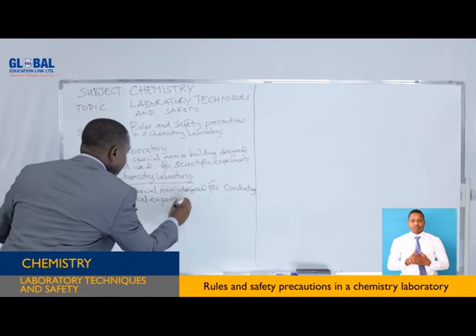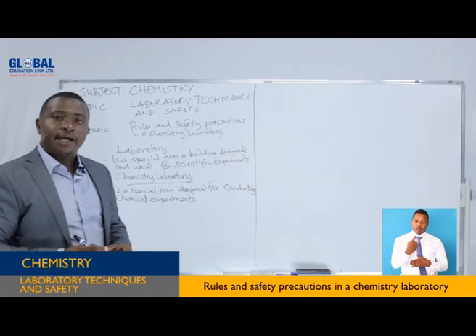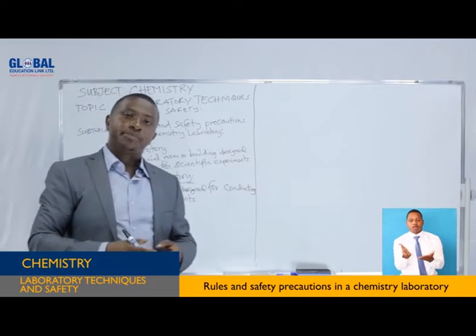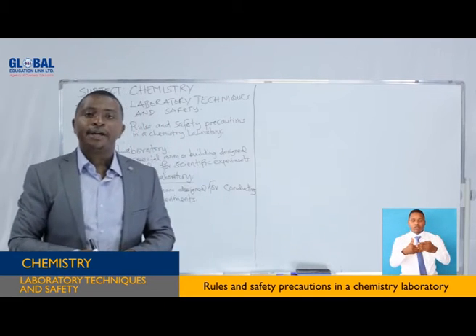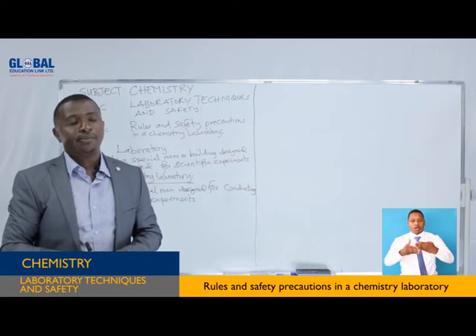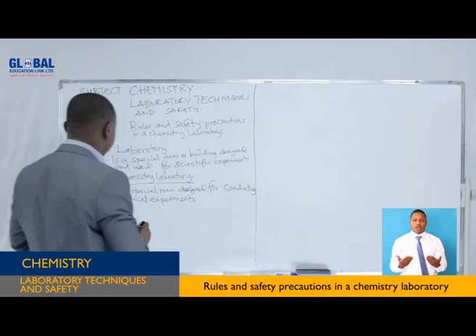I said that a chemistry laboratory is a special room, a special place, a special building whereby chemical experiments are conducted, performed or done.